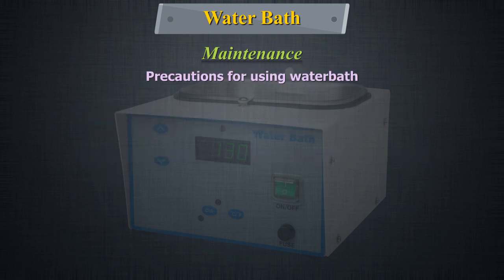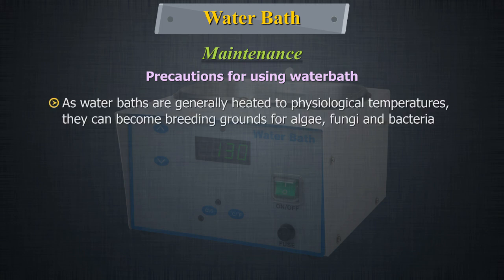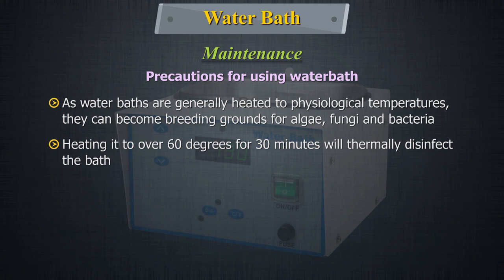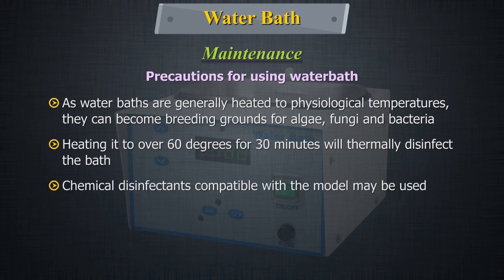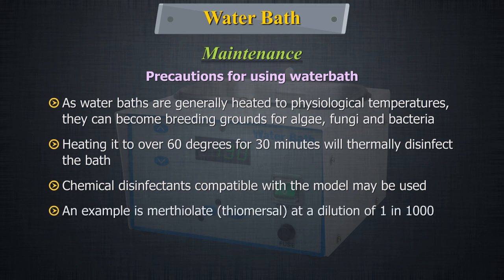As water baths are generally heated to physiological temperatures, they can become breeding grounds for algae, fungi and bacteria. Heating it to over 60°C for 30 minutes will thermally disinfect the bath. Alternatively, chemical disinfectants compatible with the model may be used. An example is merthiolate or thiomersal at a dilution of 1 in 1000.